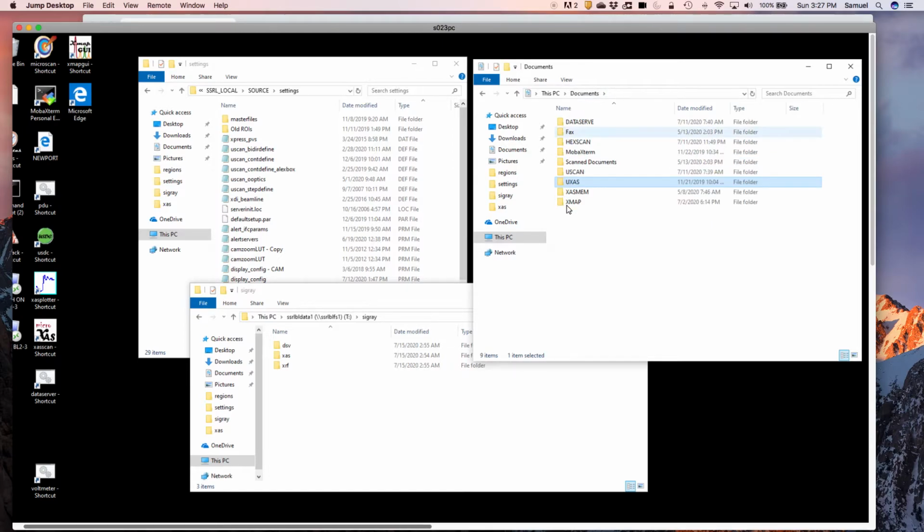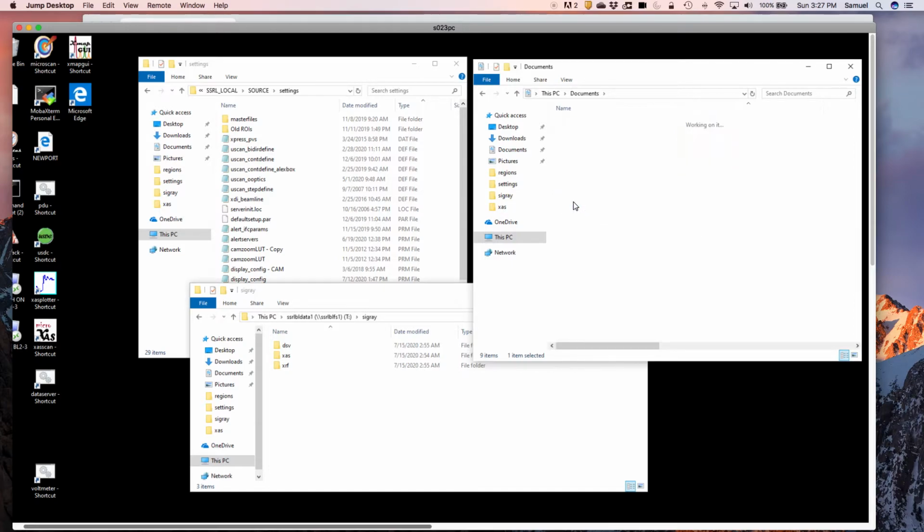Finally, in the documents folder, you do have also the XMAP folder. And this is where we save the settings for the parameters for windowing of the detector here. And it's usually recommended that every user saves your files in your folder here, so you can always refer to what those particular windows were later on.